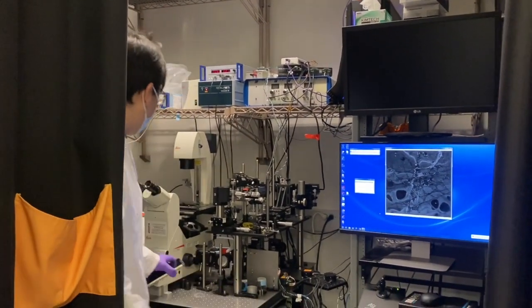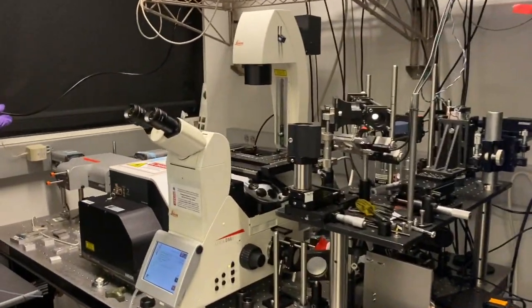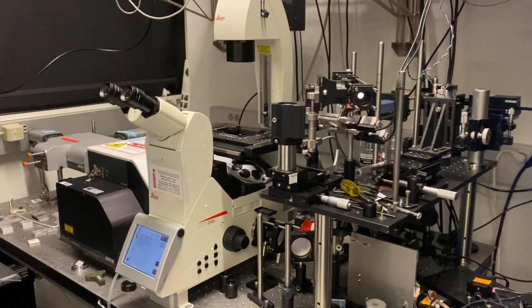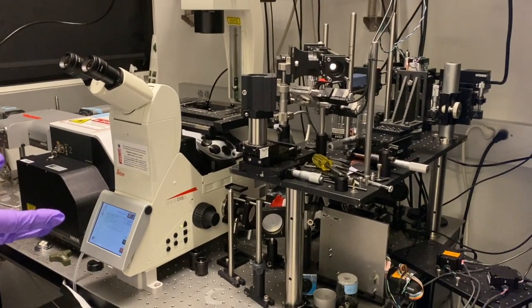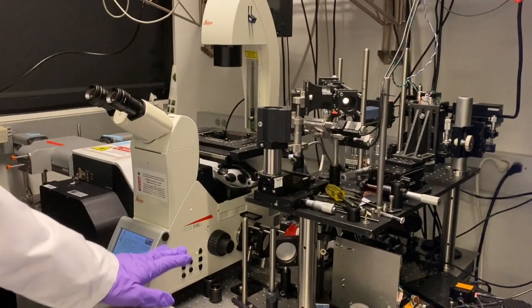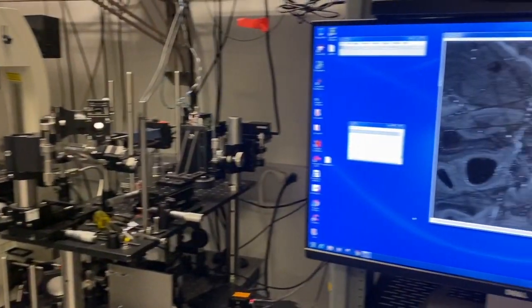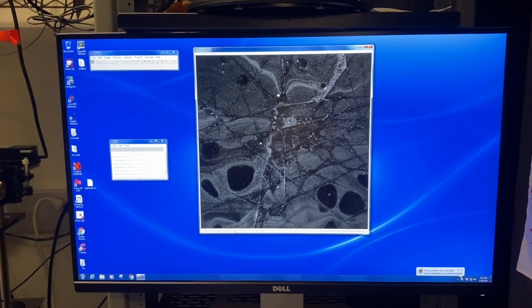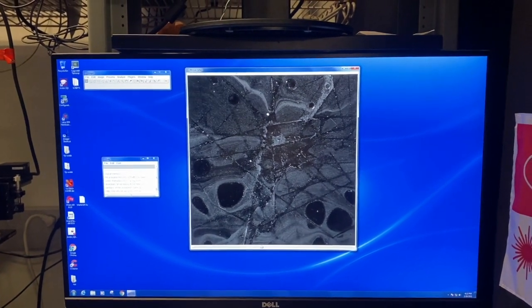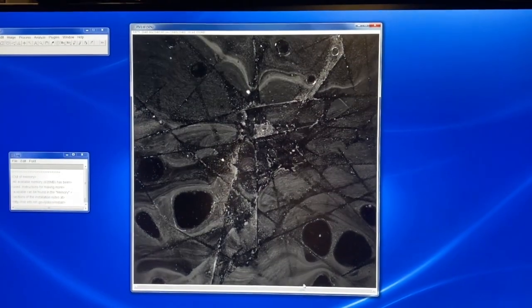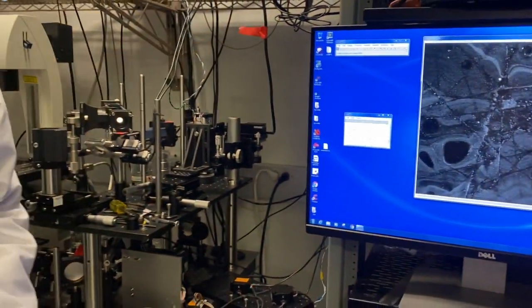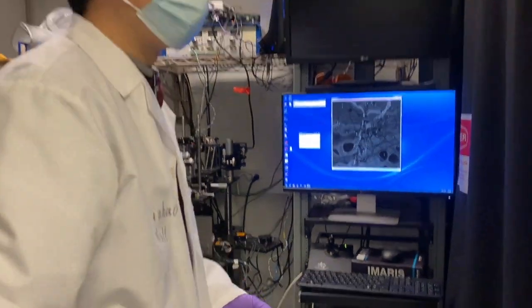We have three cameras so that in principle we can scan three different colors at the same time. We also built a diffractive setup, so we can do real-space imaging using the microscope body and do diffractive imaging of your samples. Here is one example — an image showing how a postdoc is doing particle flow. This is a time lapse capturing all the particles going through the process, and we can do particle image velocimetry to identify the flow rate and flow field of this structure.